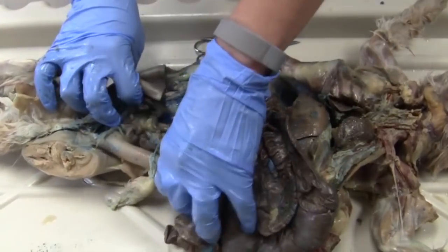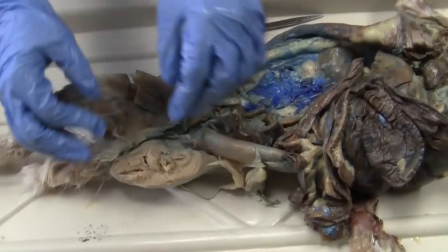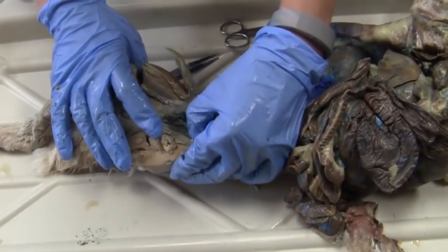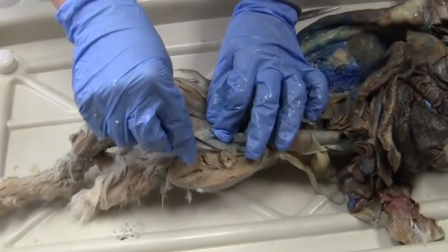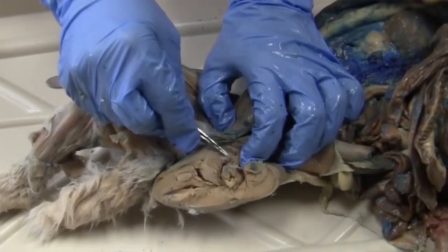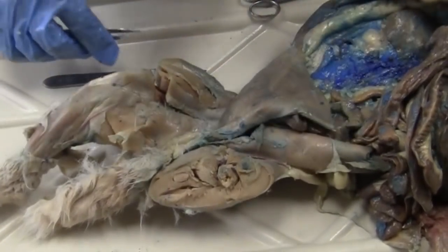And then as we move down to the legs, hopefully when you were doing either the muscle dissection or the cross section of your leg, you should be able to see the femoral arteries and veins as well. I can see it really well here within my cross section of this leg. I have both the femoral vein and the femoral artery on this side.